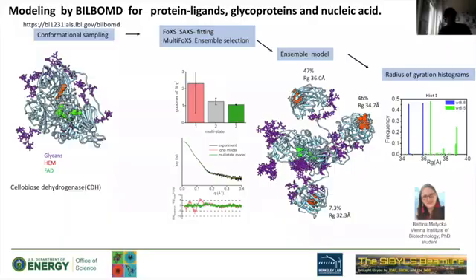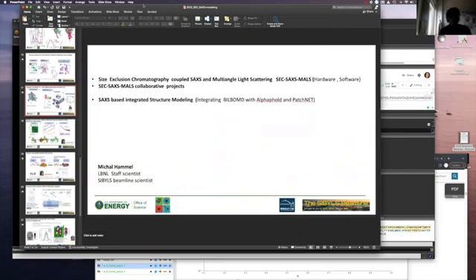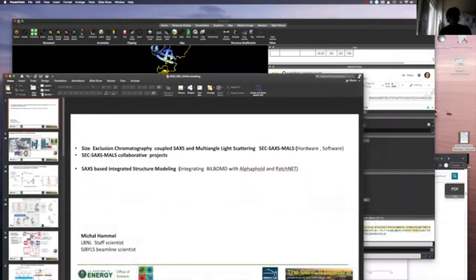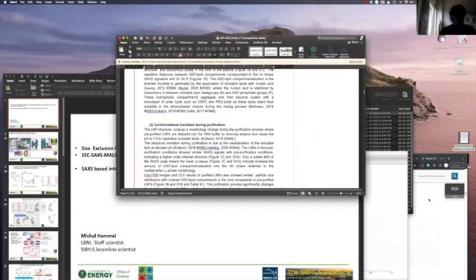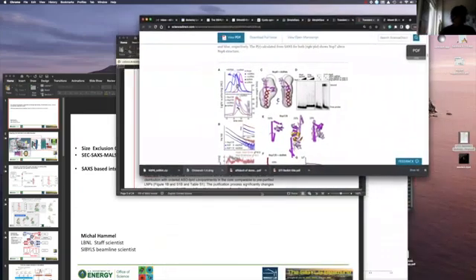Okay, so if there is no specific question for this work, I would like to show you what is possible with RAW. I know it could be repetition from Steve's talk, but I will put a link for a data set that you can work with me.